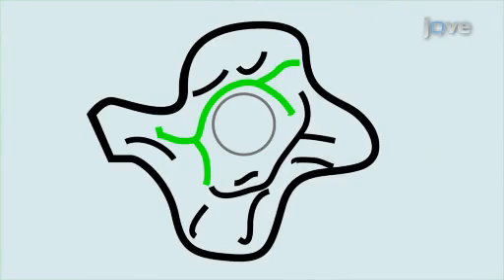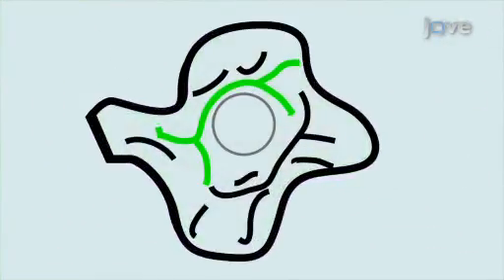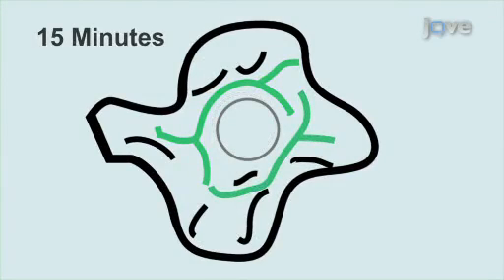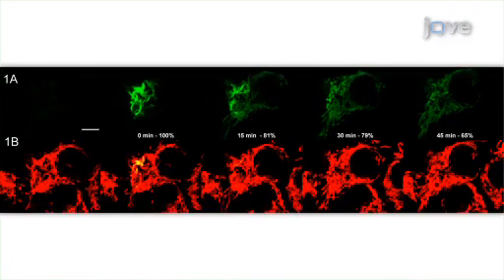Next, the GFP is photoactivated in a small region of the mitochondrial population in each cell. Then, 6 optical sections of each cell are collected every 15 minutes until signal equilibration is reached in order to assess the extent of mitochondrial fusion. Ultimately, a dilution of the mitochondria-targeted photoactivatable GFP intensity in cells undergoing mitochondrial fusion, based on quantification of the fluorescent signal, can be assessed.